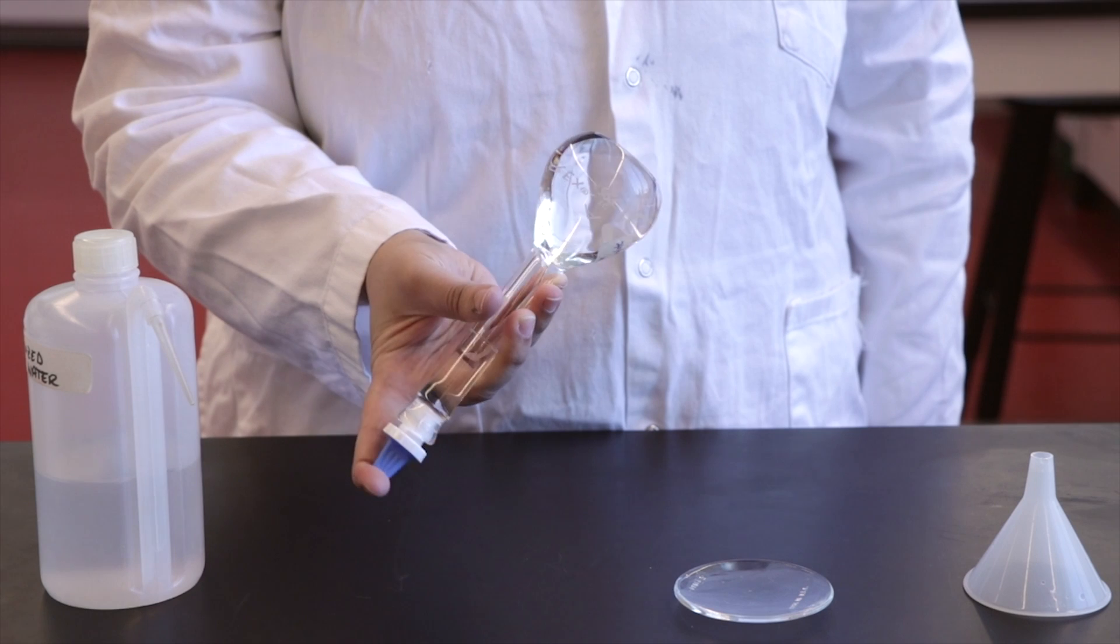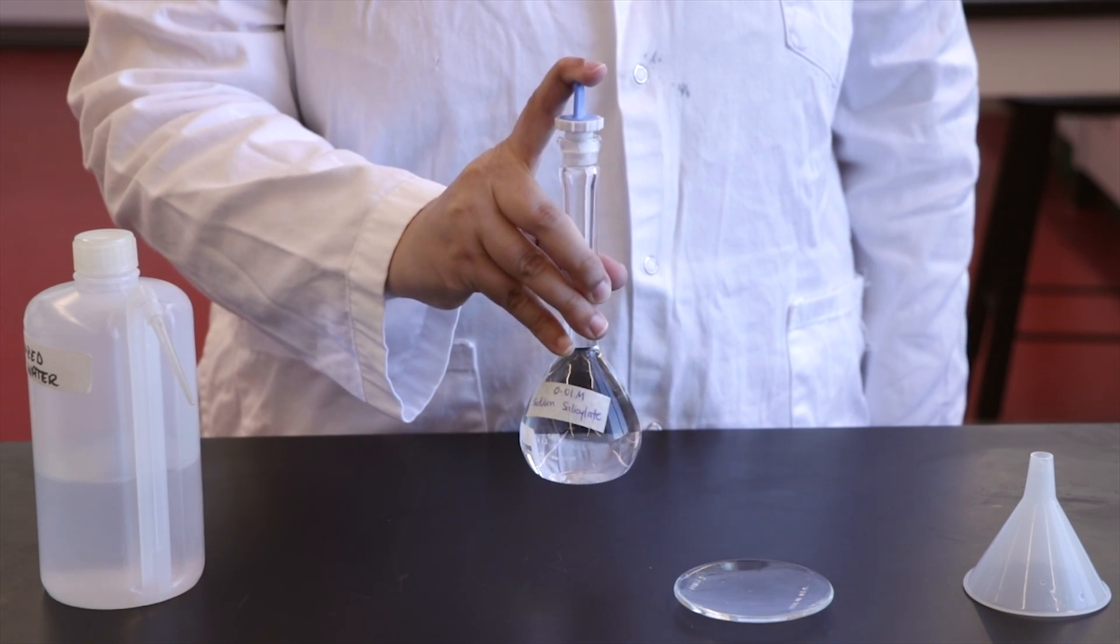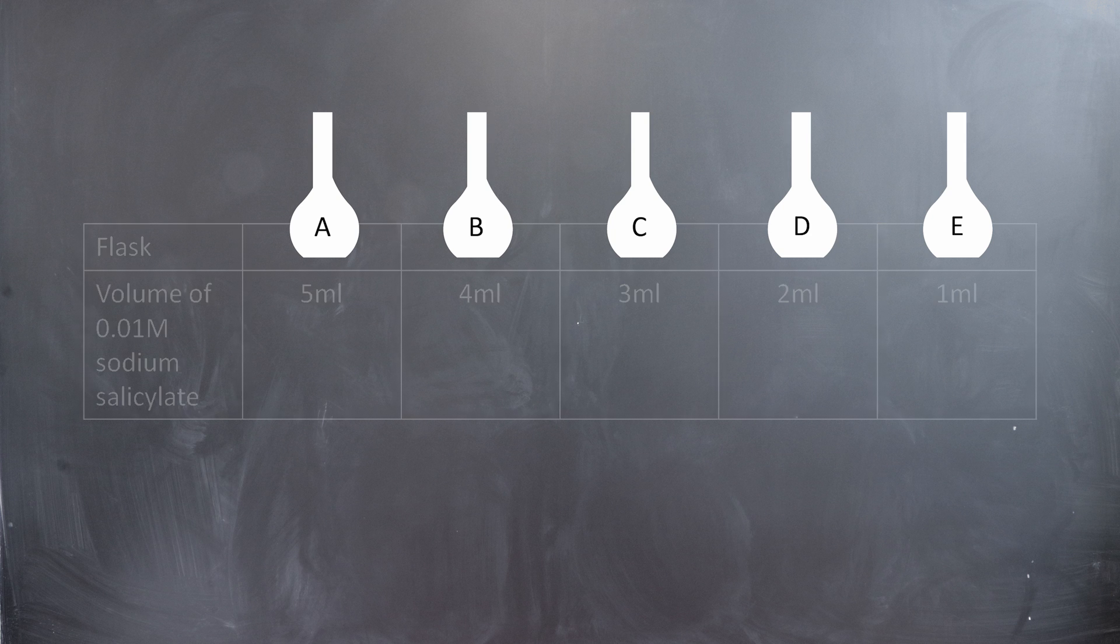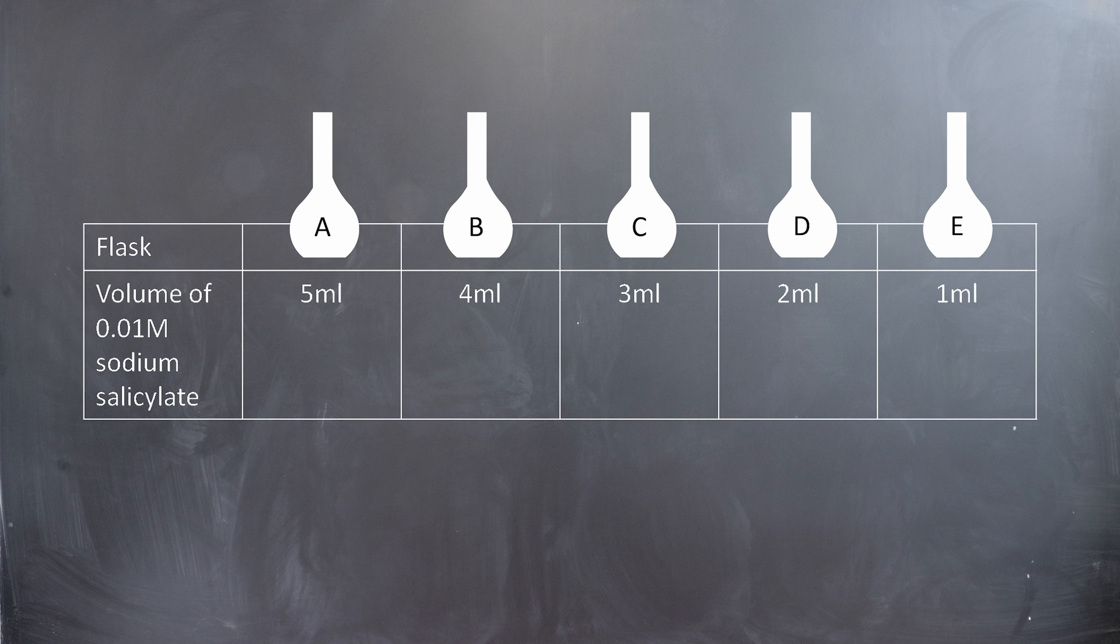You will be using the stock solution to prepare the five standard solutions. Next, use a mohr pipette to transfer the appropriate volume of stock solution into each 100 mil volumetric flask, as indicated in your lab manual.